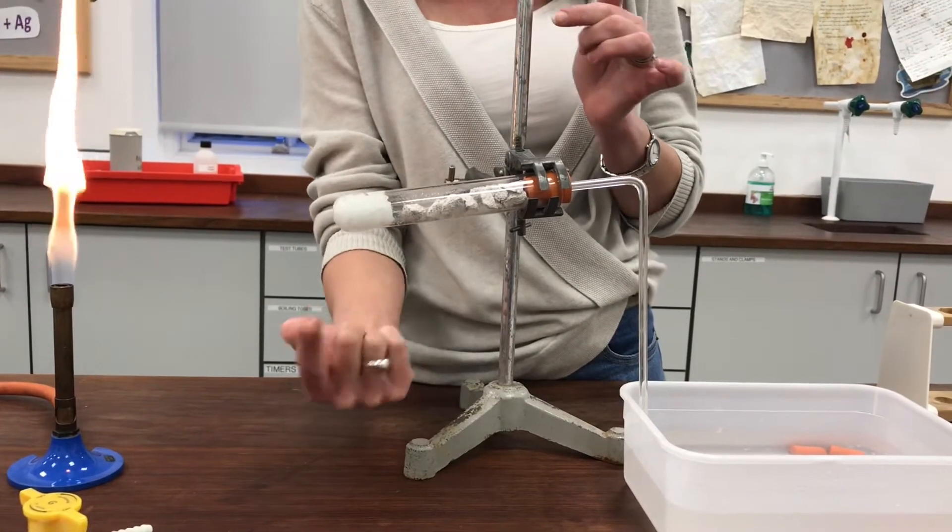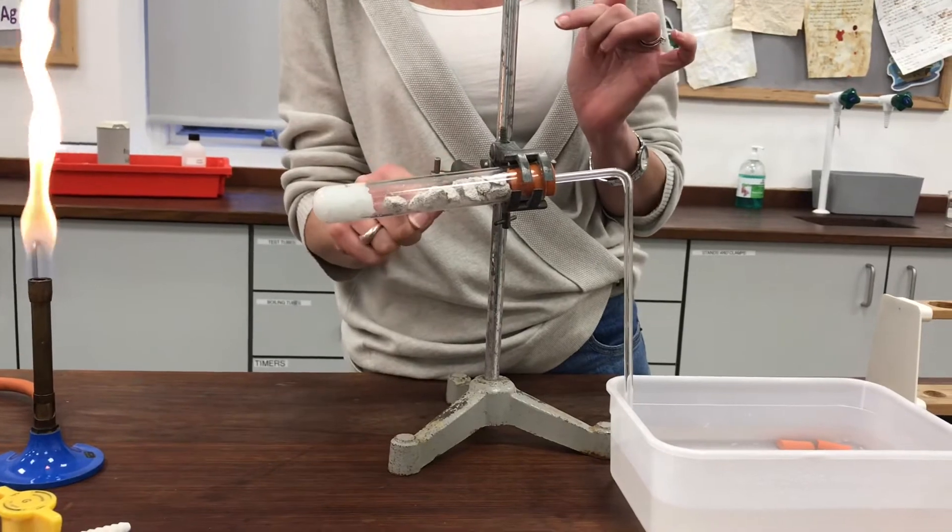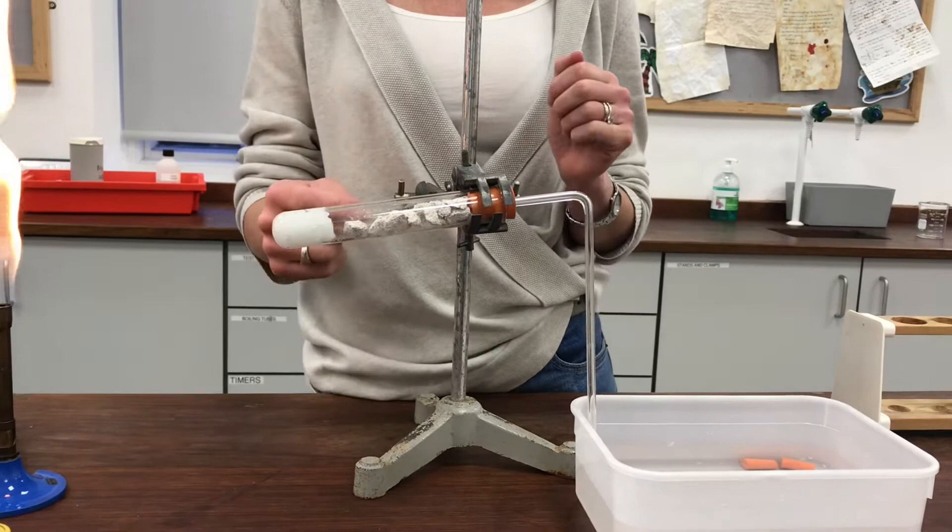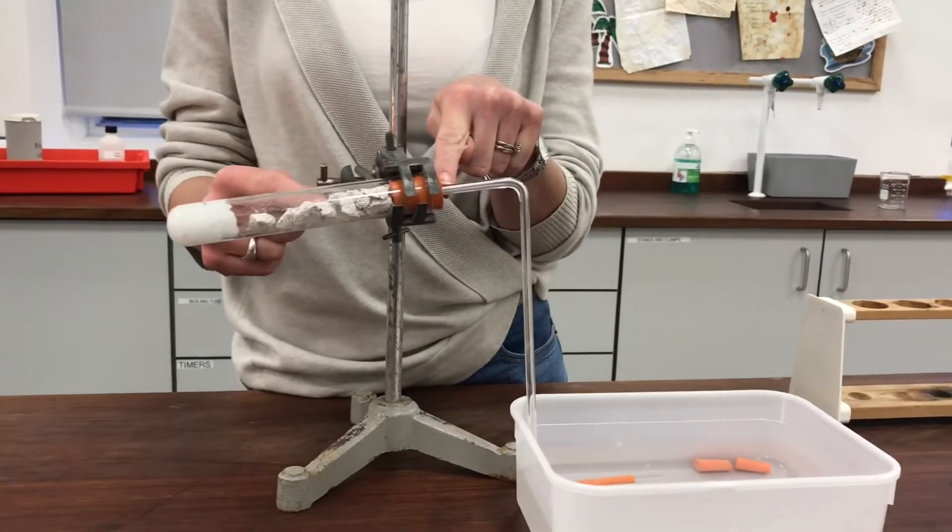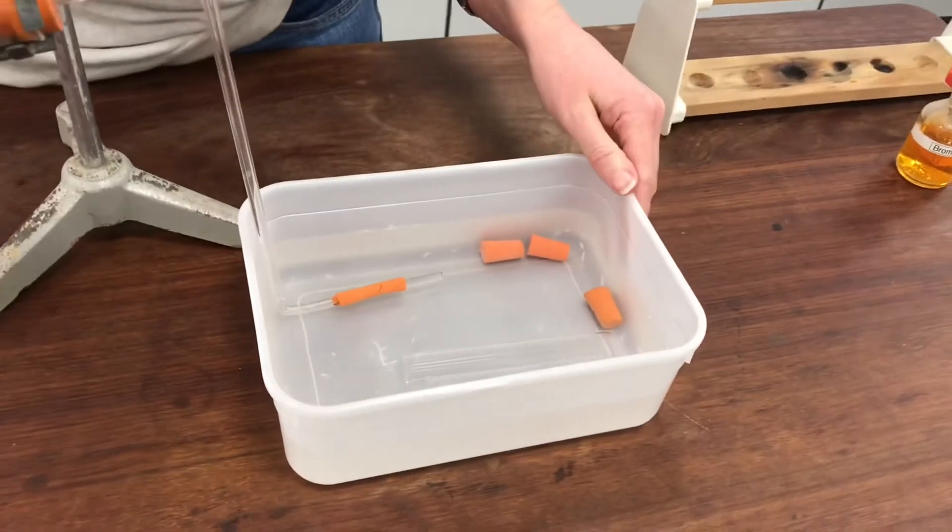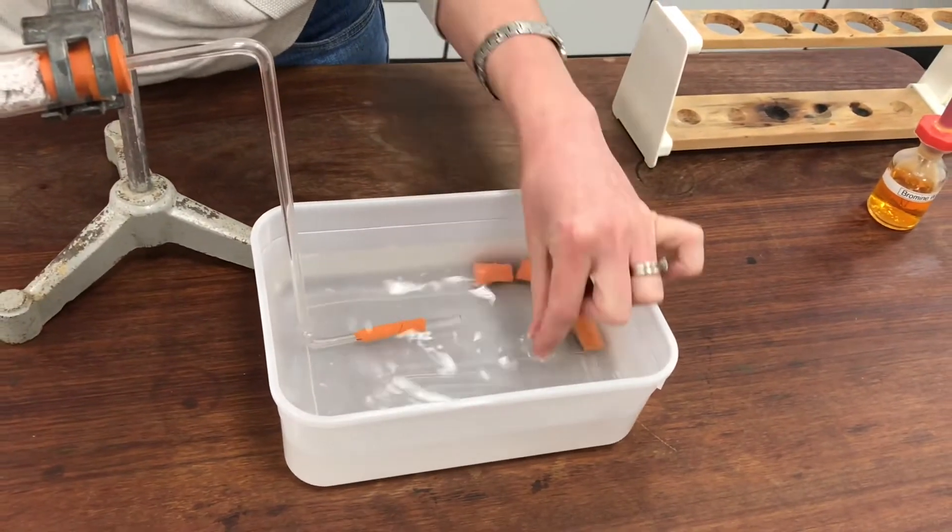so that the paraffin vaporises and hot paraffin passes over the hot catalyst. The cracking reaction should then occur and I'll end up with a smaller molecule moving along this delivery tube and down and out of the end here in the water bath.